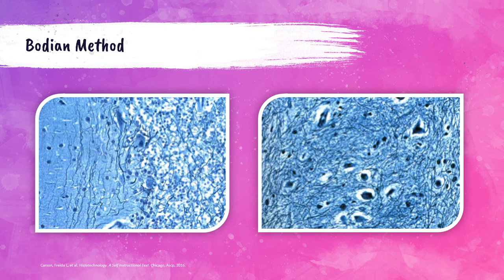A photo with the aniline blue counterstain shows a cerebellum tissue Bodian stained: nerve fibers and nuclei are visible in black. An example of overstaining with the aniline blue counterstain shows that the contrast between the background and the black-stained axons is lost — this is an unacceptable result. The properly stained slide on the left is acceptable; the overstained one on the right is not.